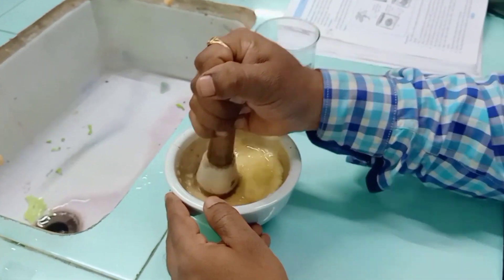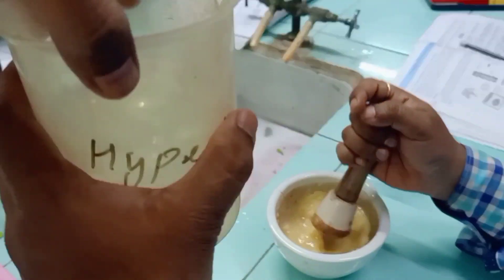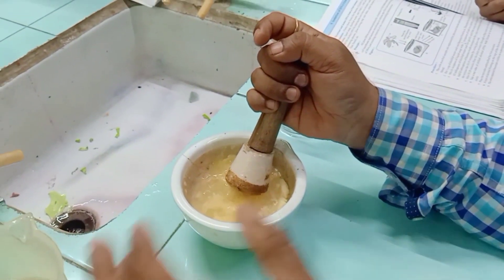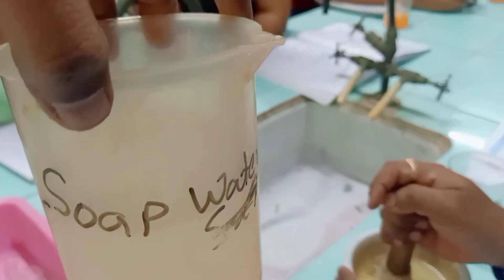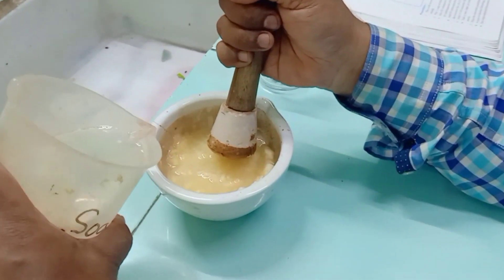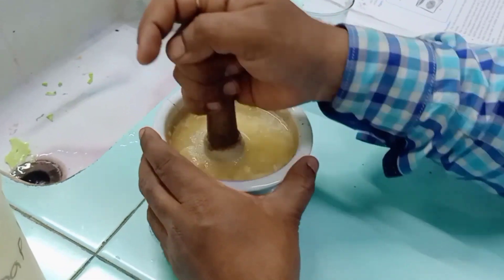Once we have made the slurry, we add distilled water. Then we add the hypertonic solution and salt. The detergent — the soap — helps to break down the cell membrane and release the DNA.